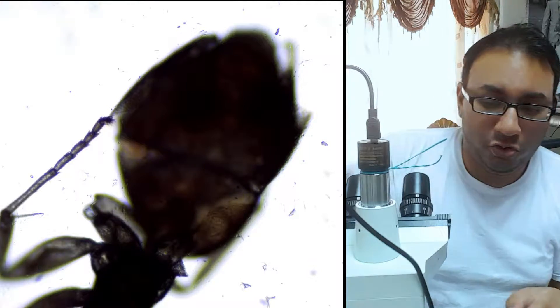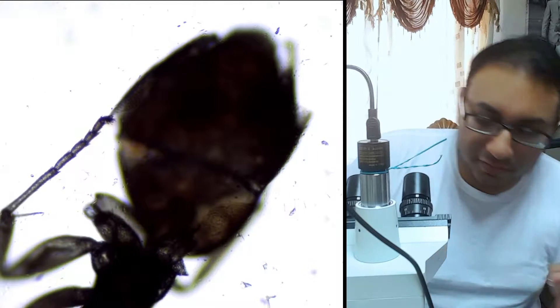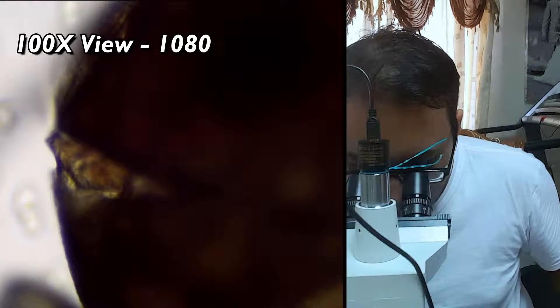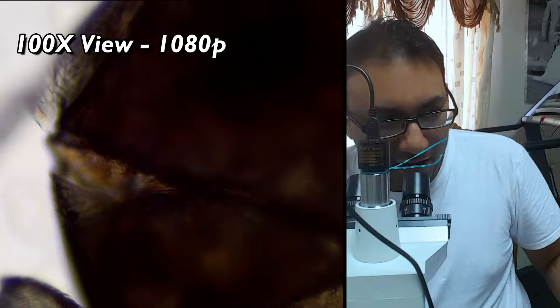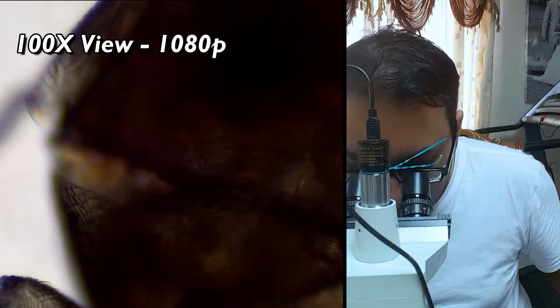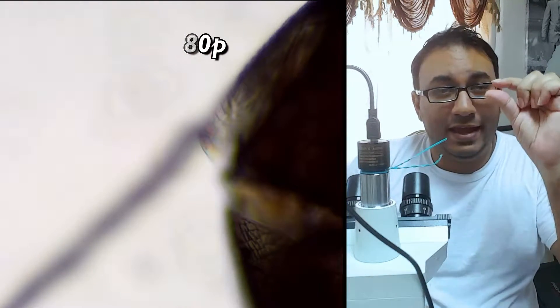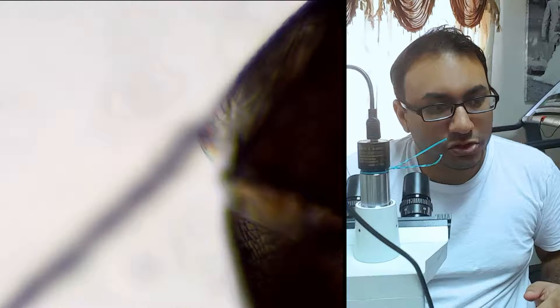Let me quickly go over to 100X — let's have a look at 100X. That is what we see at 100X. I'm trying to figure out — that should most likely be the head of the ant. Because the ant itself is thick, you'll see certain areas that are blurry and certain areas that are not. It's not something with the lens; it's because it's a 3D object. The layers — even though very small — between the head and the back of the head is why you see it looking blurry.